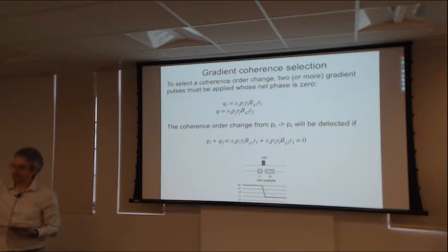We can untwist the helix by applying a gradient with the opposite sign, charging the coil with the opposite electrical polarity. Or we could apply a 180-degree pulse, which reverses the sense of rotation of the spins, and then apply a gradient with the same polarity, and now the helix unwinds, and the signal comes back. So this is called a gradient echo, when we use the second gradient to undo the winding up of the first.